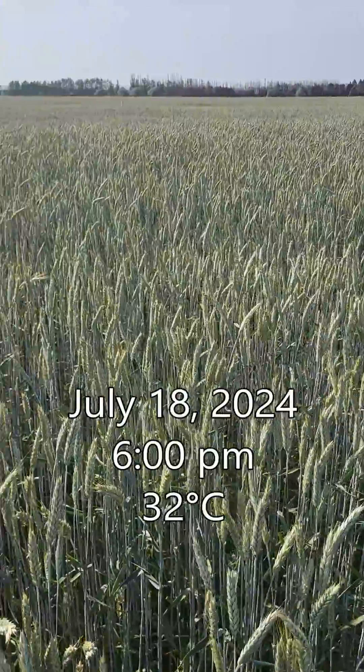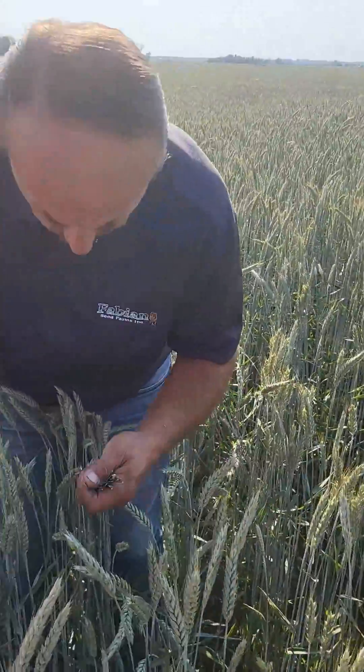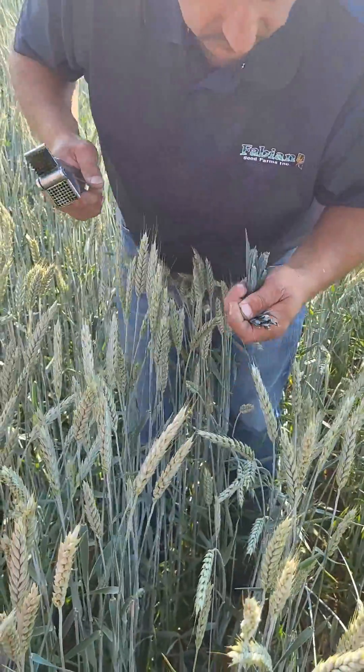We're standing in our field of Spring Triticale AAC Delight and we're going to go through a refractometer test to just give a general indication of plant health.